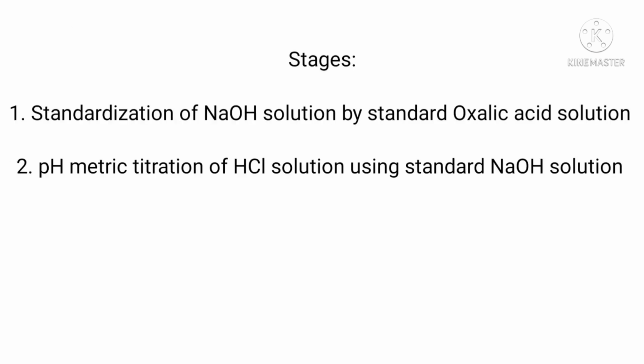This experiment consists of two stages. In the first stage, we will standardize recently prepared NaOH solution by standard oxalic acid solution. And in the second stage of this experiment, we titrate the supplied HCl solution against the standardized NaOH solution using a pH meter.